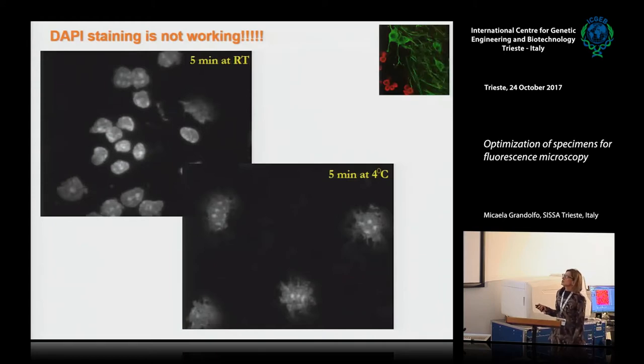Okay? So of course you can fix your sample at 4 degrees, but take care of the time, because it will take longer. Okay? And 5 minutes is a very, very short time for fixation with aldehydes. So if you're using a very short time, you cannot decrease the temperature. Okay?